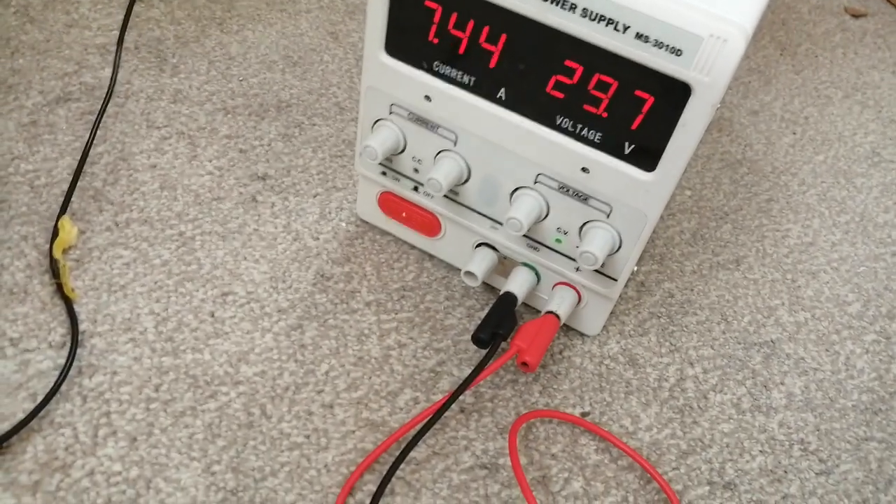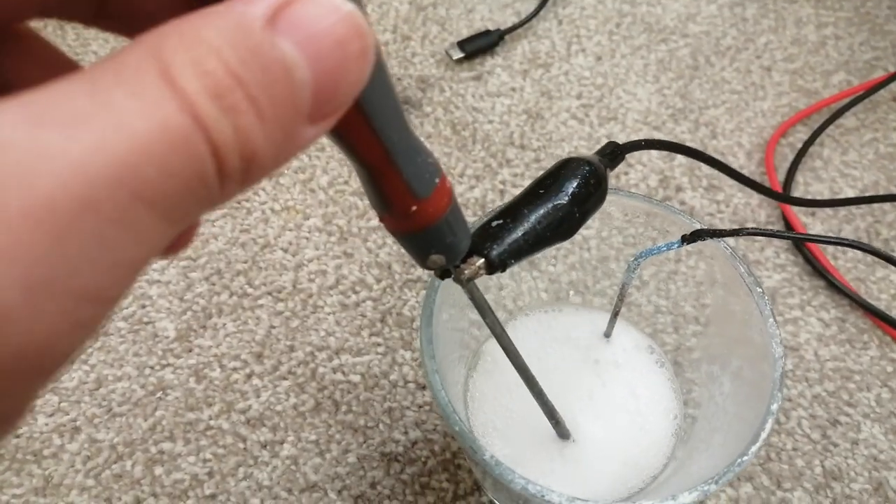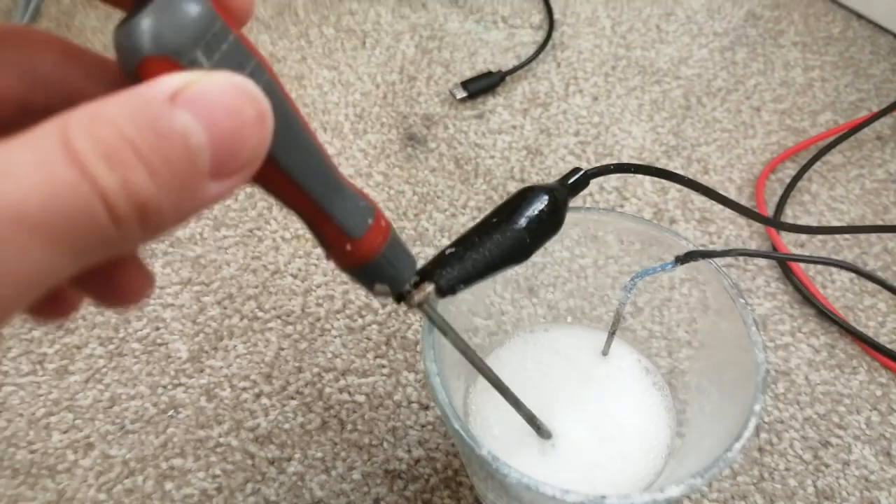Here you can see it's been turned up all the way to 29 volts DC. And now it's fizzing very vigorously.